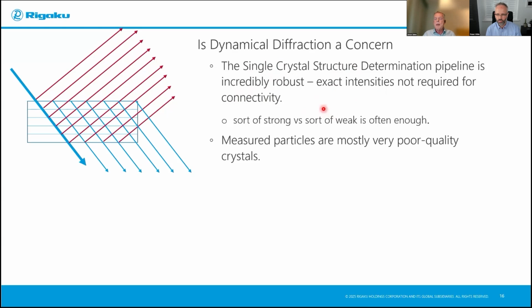On this schematic on the left-hand side, I've really tried to indicate what I mean by dynamical diffraction and how does it happen and what do you need for it to occur? Well, we have this incoming electron beam in blue, and here's an idealized perfect crystal in the Bragg and Laue model with perfect atomic planes. As the electron beam shoots through, it strongly interacts with these atomic planes, and the electrons are diffracted out at another angle.